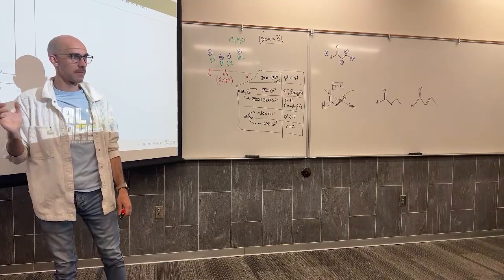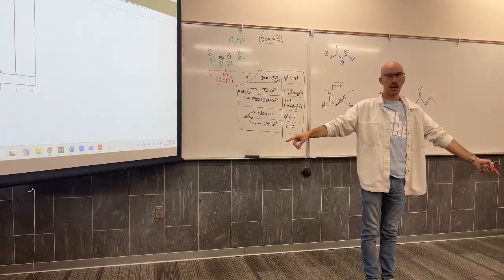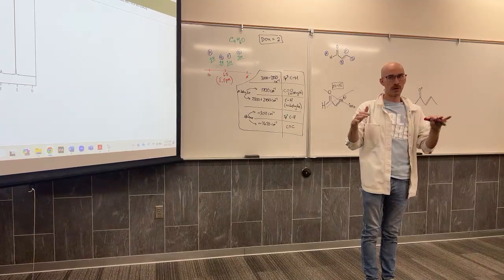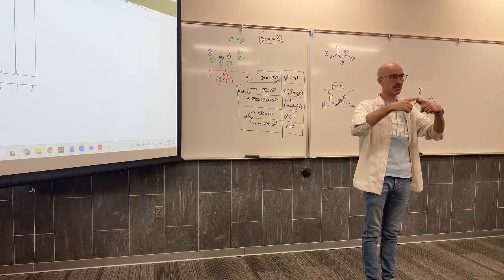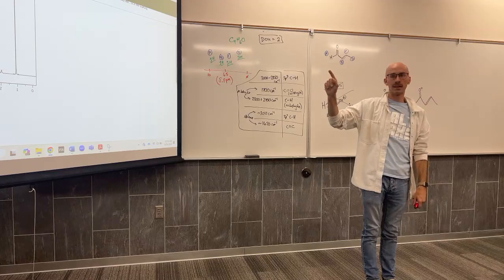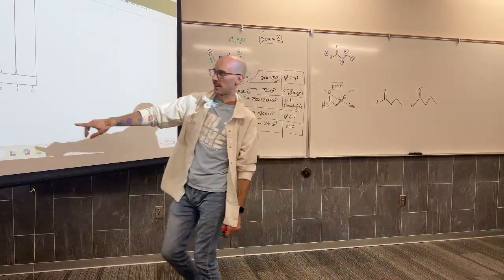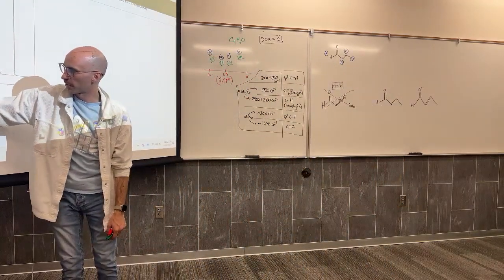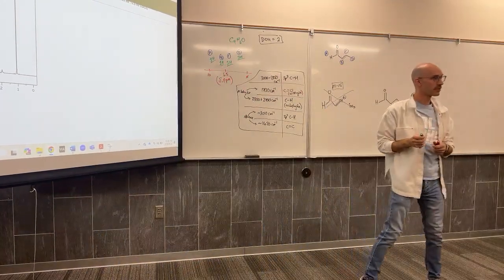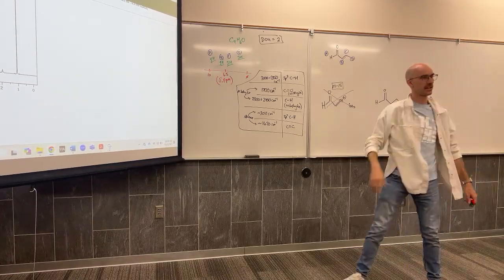It's a hydrogen. But that hydrogen doesn't count as a neighbor to the hydrogens on carbons, and it doesn't get split by hydrogens on carbons. It does not count with multiplicity. Multiplicity is a communication of hydrogens through a carbon chain. Heteroatoms block that. This is a hydrogen that shares a carbon with a heteroatom, and those signals we know shift pretty far left. But what about the hydrogen that is bonded to the heteroatom? Shouldn't that be at the end of the spectrum?